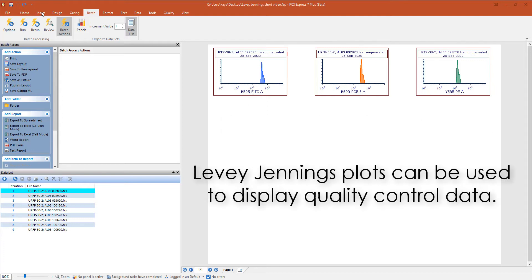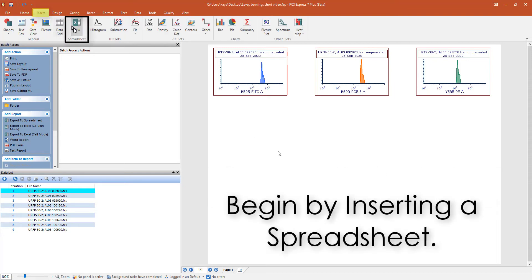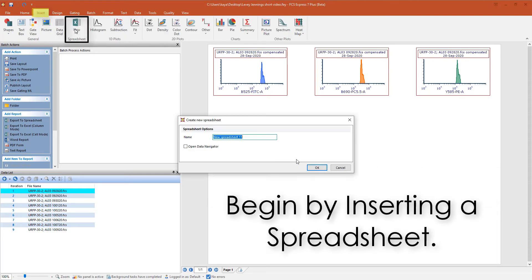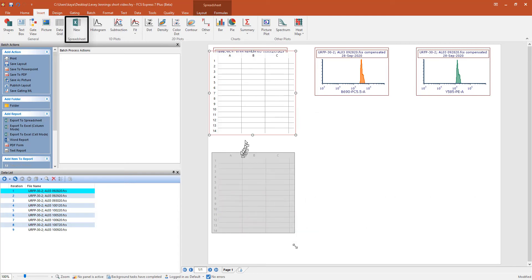From the Insert tab, click New Spreadsheet. Click OK and move the spreadsheet to a blank spot of your layout.